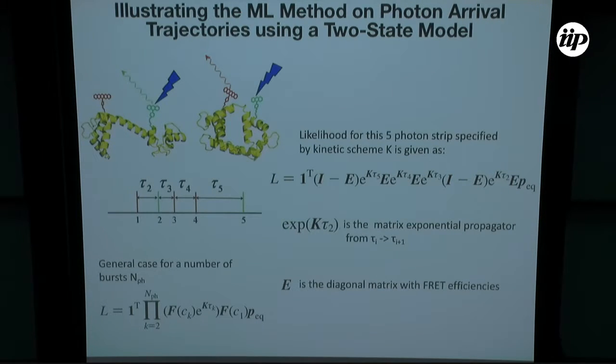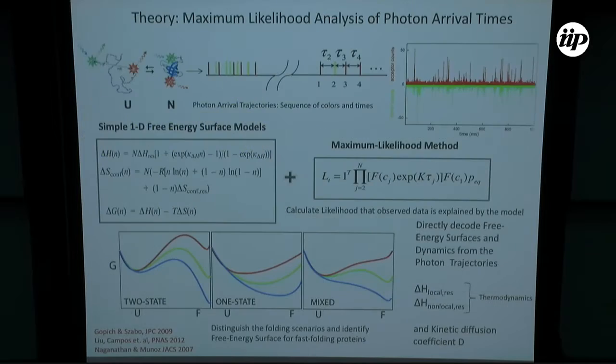And the idea was to try to extend this model into this analysis, or into some model that is more flexible. And you can probably guess what kind of model we wanted to use again, which is the same one that I introduced already this morning. It's this model that is a free energy surface, one-dimensional model, and all these things, which the equations are here. The nice feature about this is that you can actually modify the barrier height and the position of the minima according to the parameters. It has the same number of parameters as a two-state model, but it gives you much more, because in principle the same model, depending on the parameters, can switch from being one state to being two-state, or being something in between.